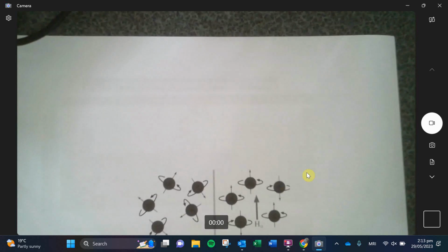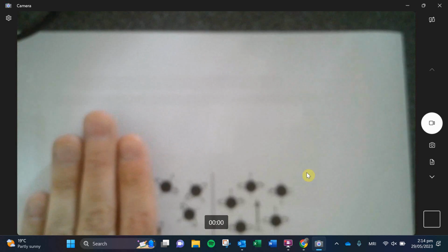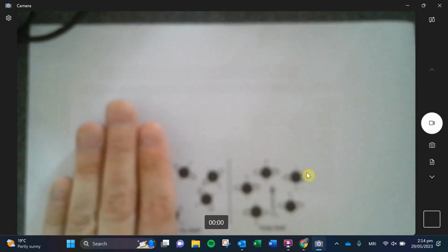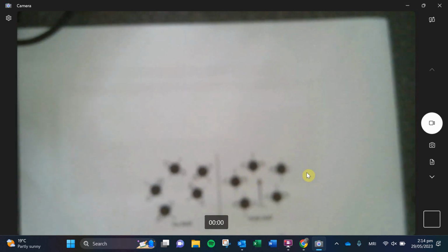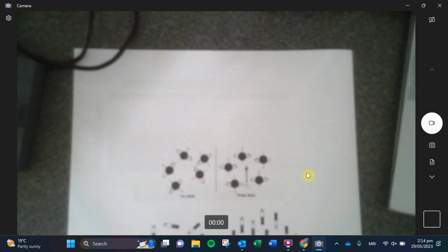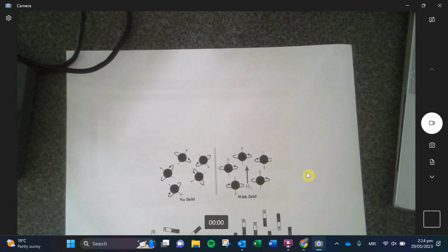How about you focus? Oh my goodness, why aren't you focusing? I don't know if it just doesn't like this computer, because it doesn't seem to have this problem when I use my computer. Certain distance that you want to be from? Okay, fine. Okie dokie, let's get started.